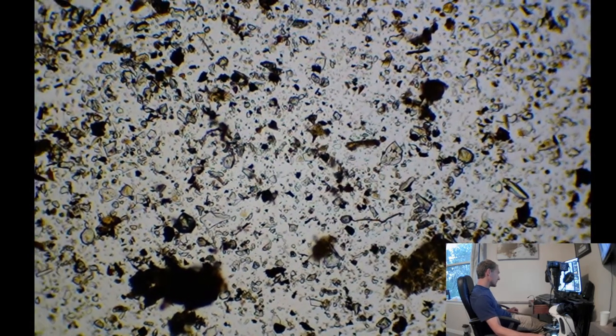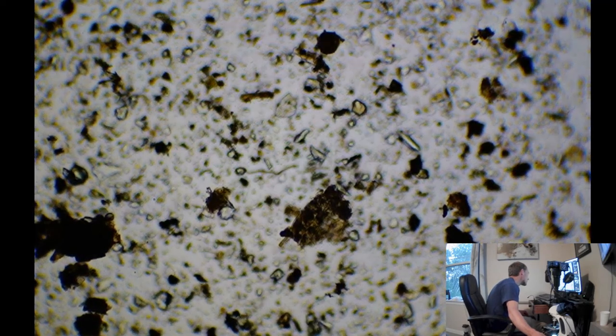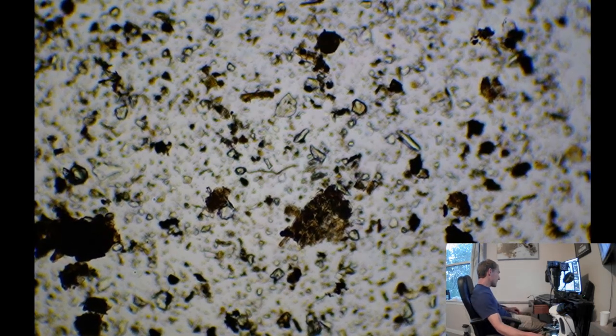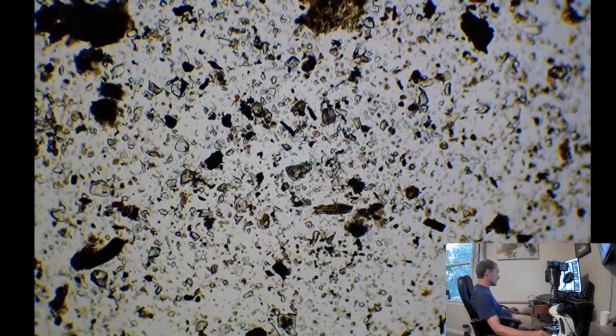There's a nice looking fungi there in the middle. Wonder if that's it coming out of a spore, if it's just, no, it looks like it's just attached to that piece of sand or silt there. It's probably getting some nutrients out of there. Working on feeding the plants.